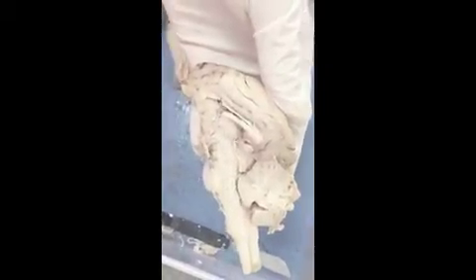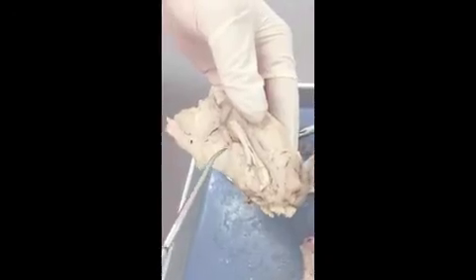This bulb right here is the pineal gland, which produces the hormone melatonin at night. And then right here is the thalamus, which controls sensation and emotion. And then below it is the hypothalamus, which controls heart rate, blood pressure, and body temperature.